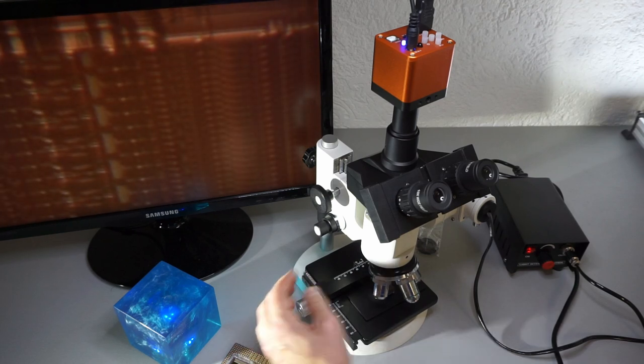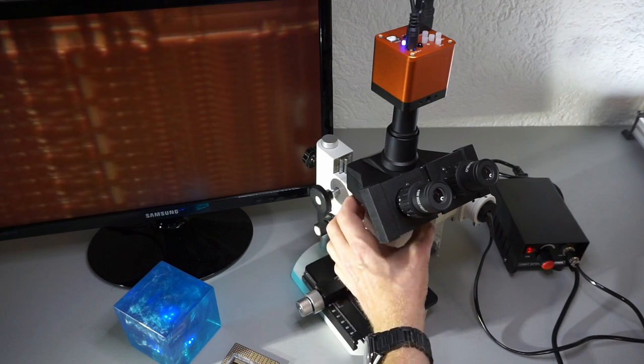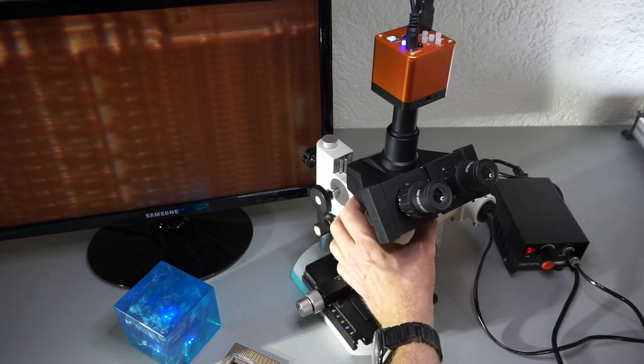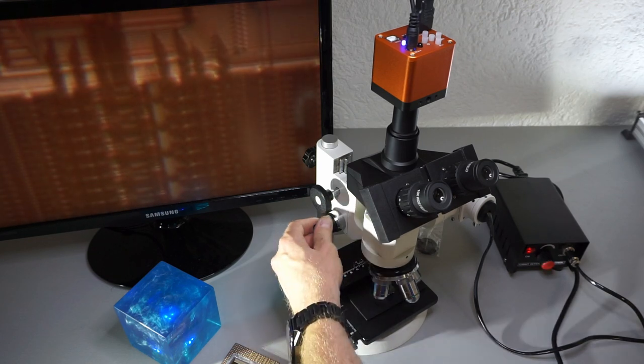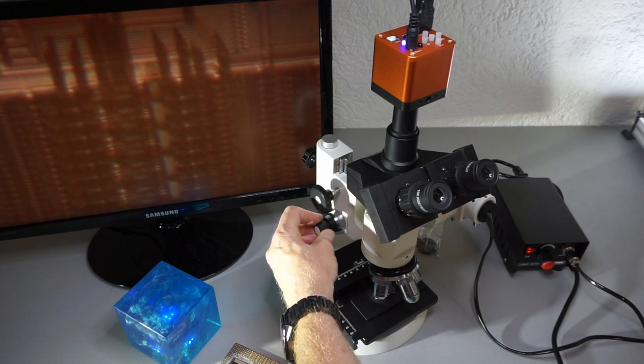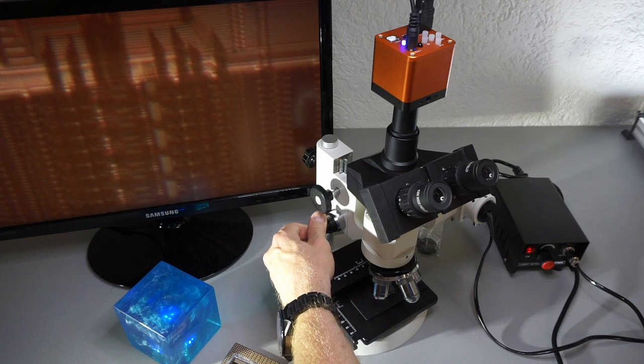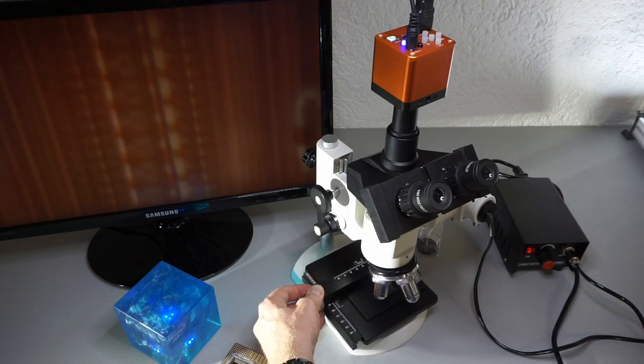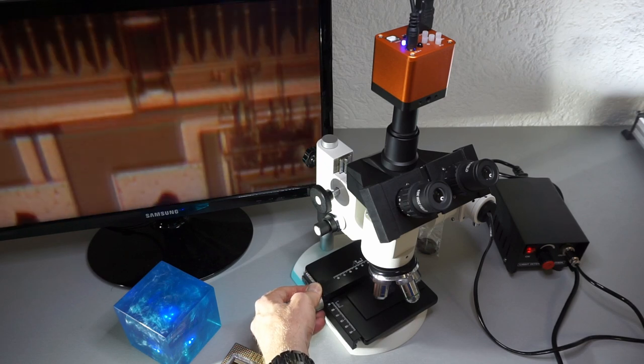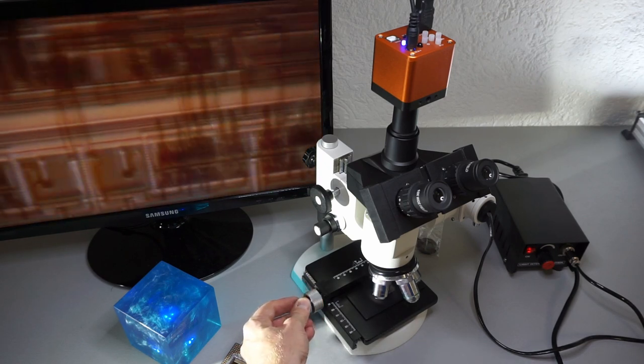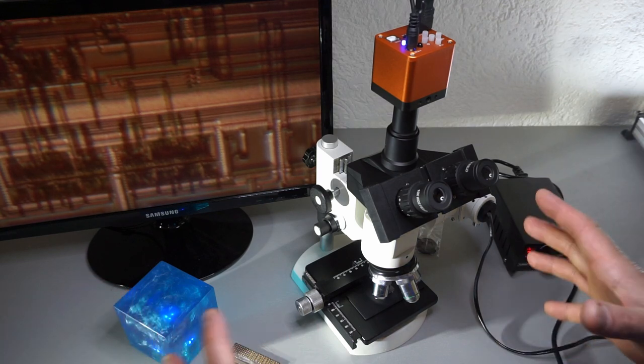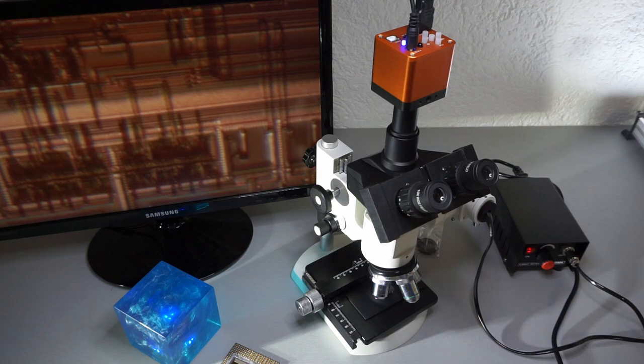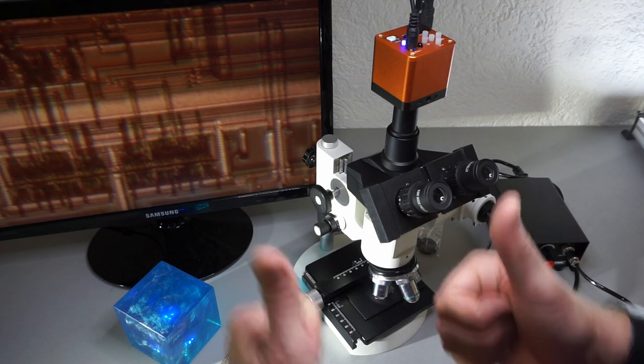Wow, I'm super happy. I have not yet found out really what the polarizer does, so I have to play a bit around. But yeah, super happy looking at the first results, looking at my very first chips using this metallurgy microscope from Radical. I would say it's a wrap for the device. Thumbs up.